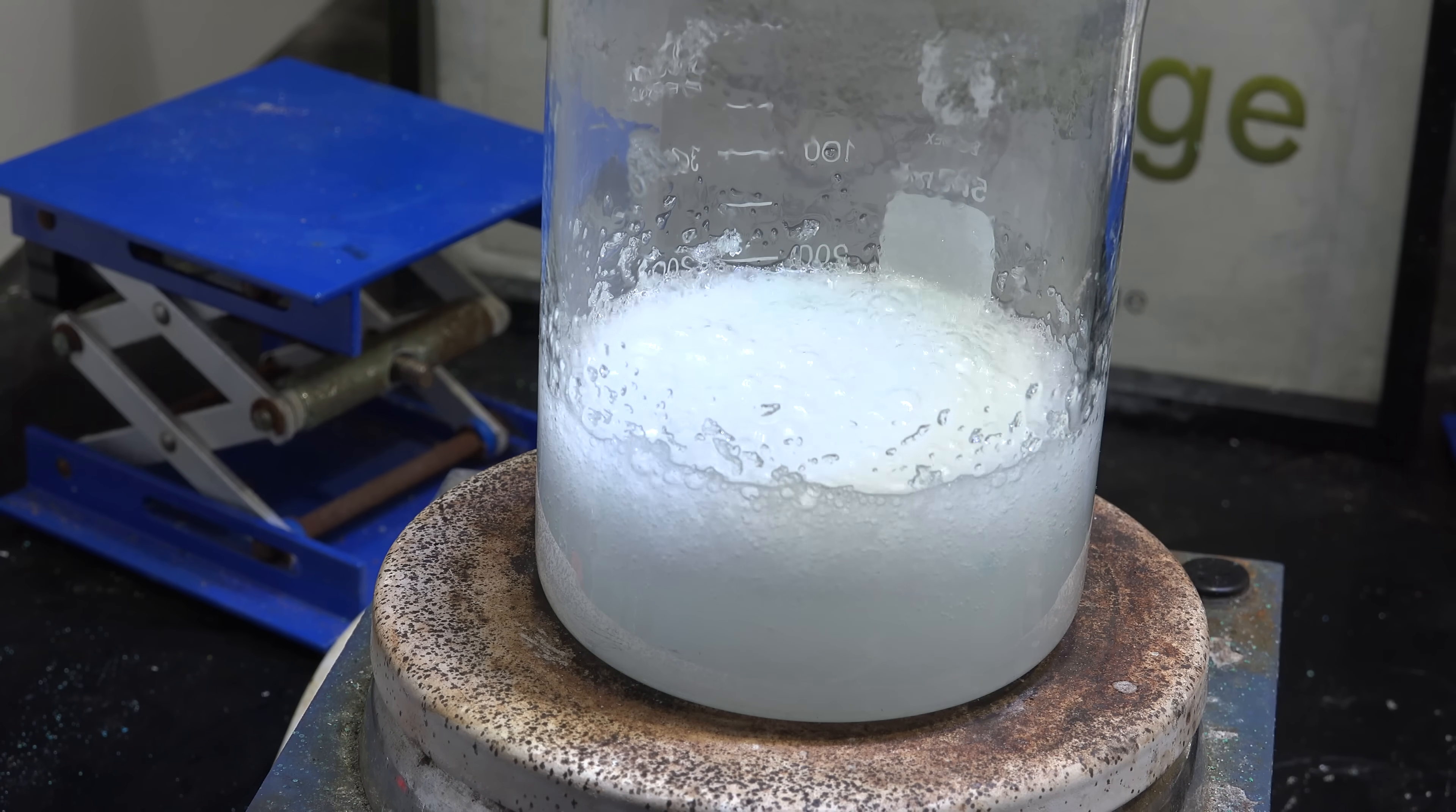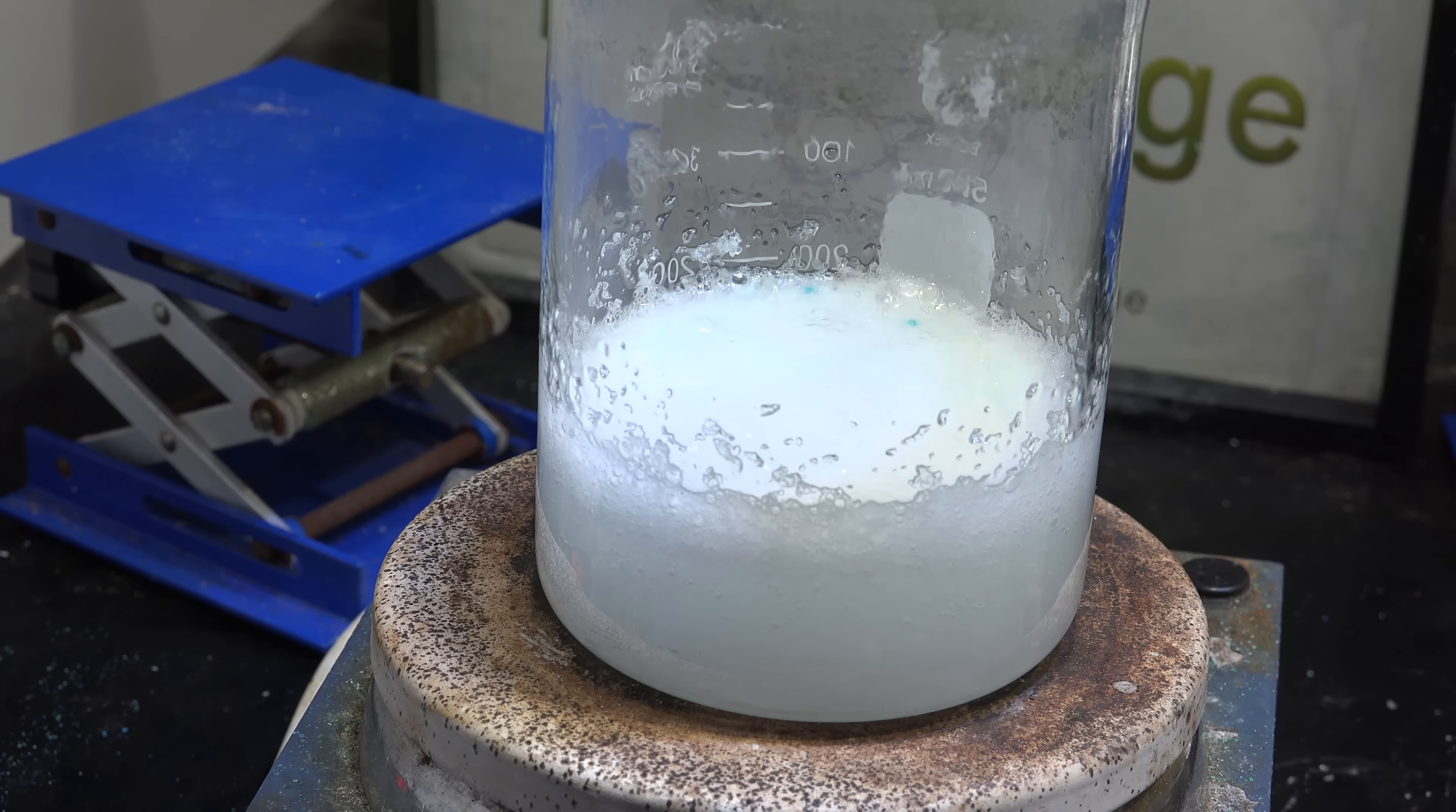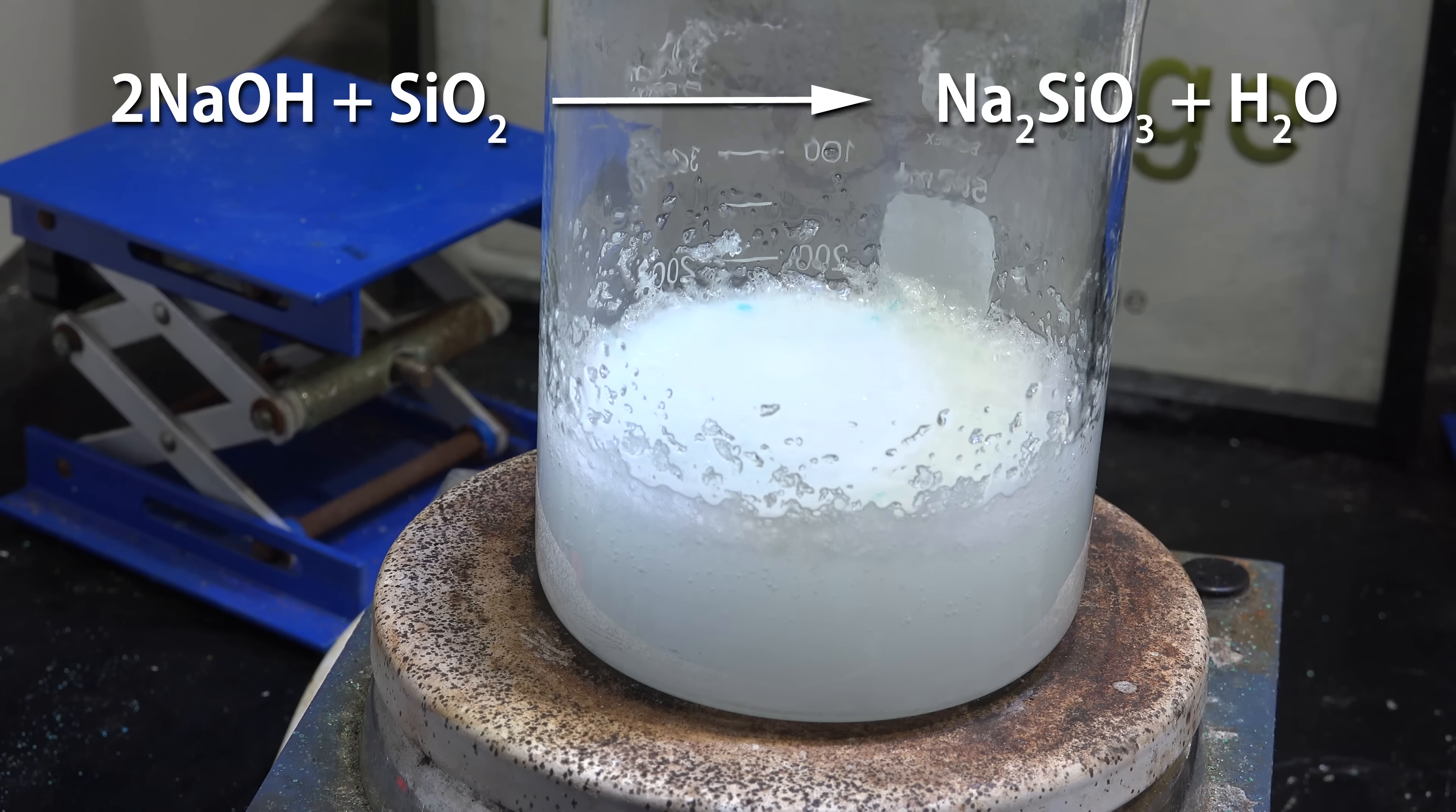So what's happening? Silica gel is essentially amorphous silicon dioxide that's being made by aqueous chemistry. The sodium hydroxide dissolves the silica gel to form sodium silicate.